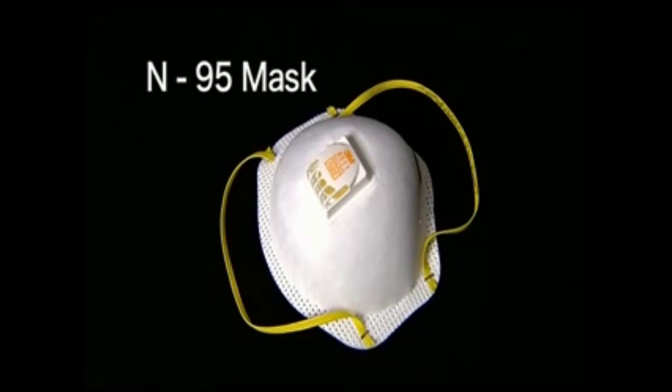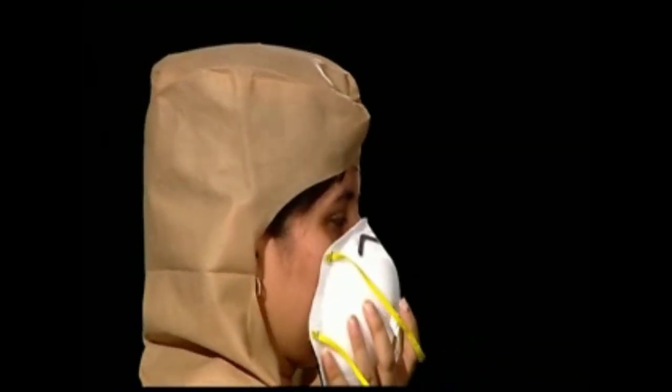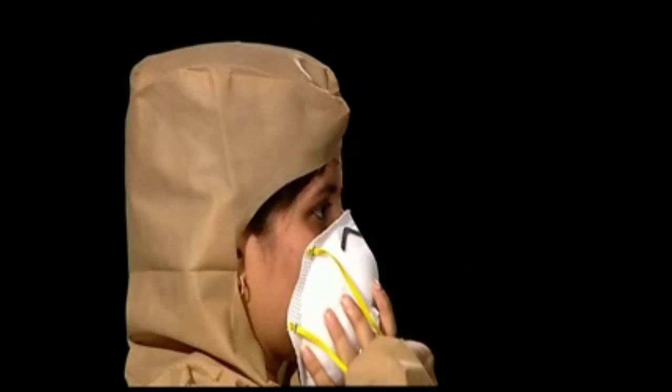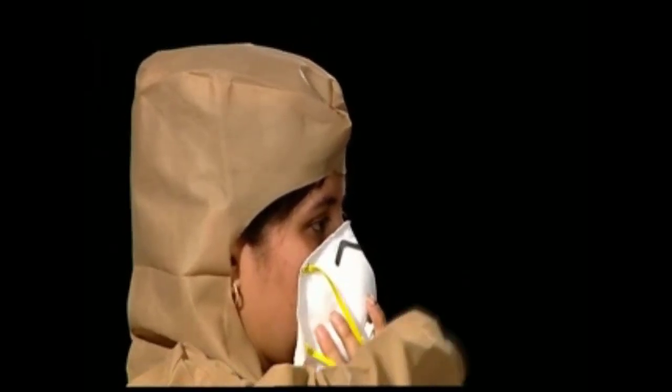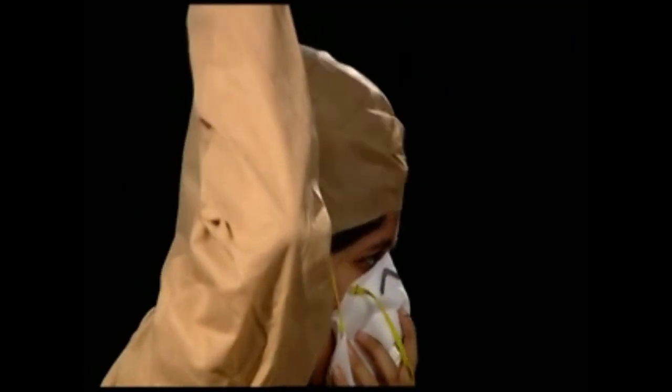To put the N95 respirator mask, place it on your face in a manner that it covers the nose and the mouth, using the other hand fasten the upper string. Once the strings are in place, use the index fingers of both hands to firmly clasp the metallic clip over the nose.